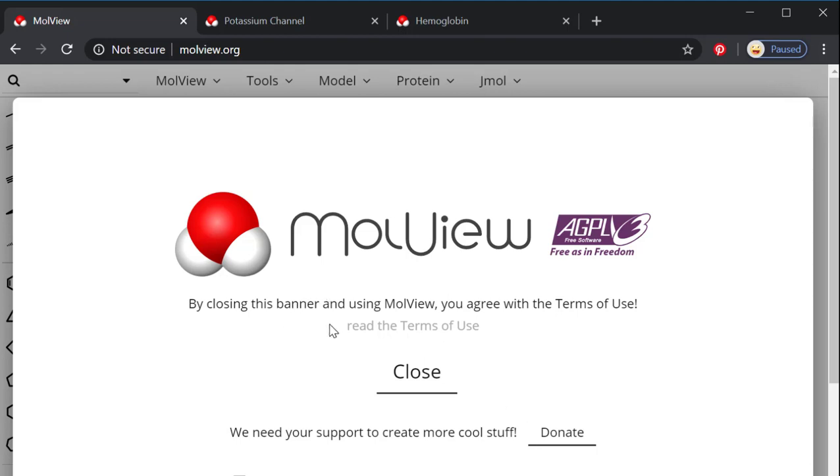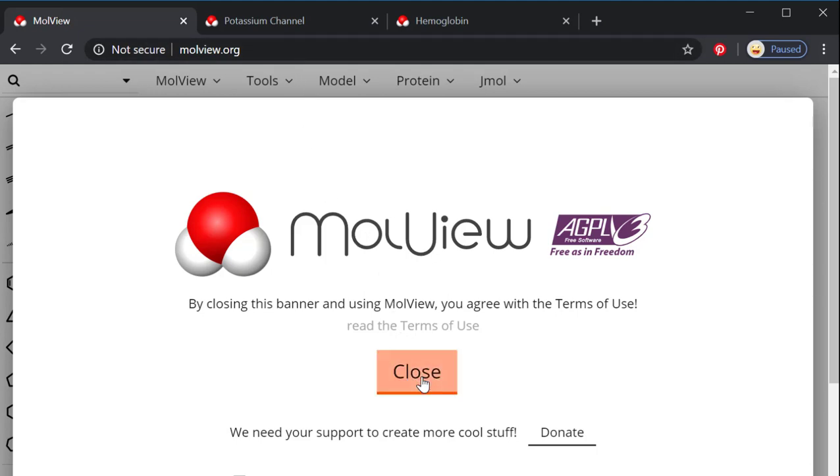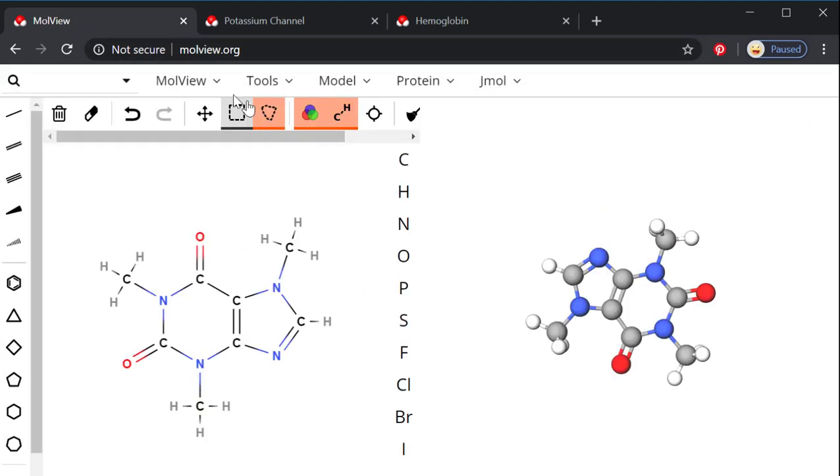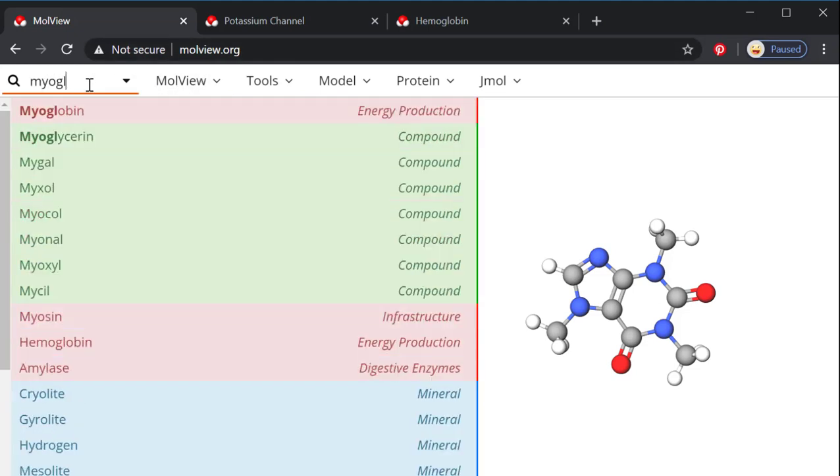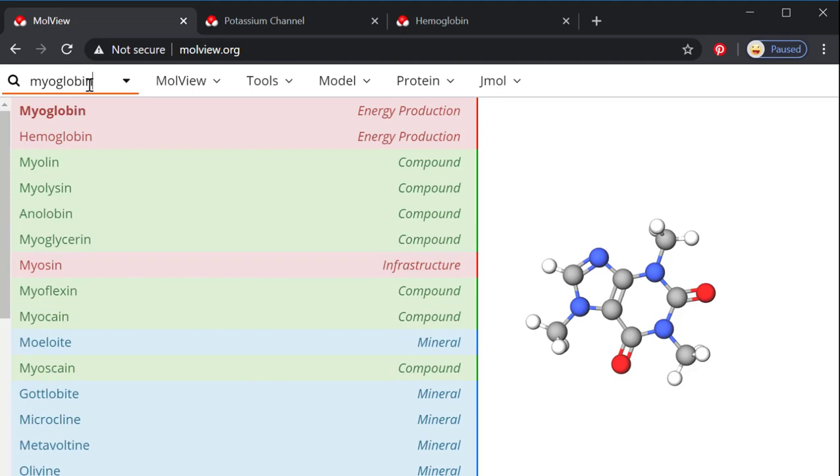We're going to take a look at just a few of the very basic ways to look at proteins on Malvue, so malvue.org, and it always starts here with caffeine, but I'm going to look at myoglobin today, which is found in our muscles.